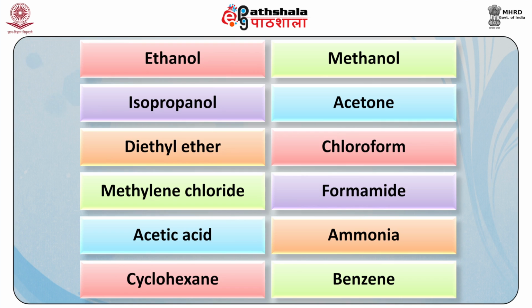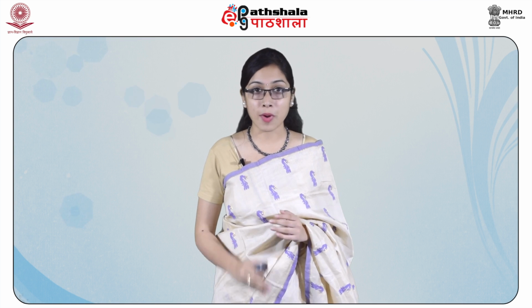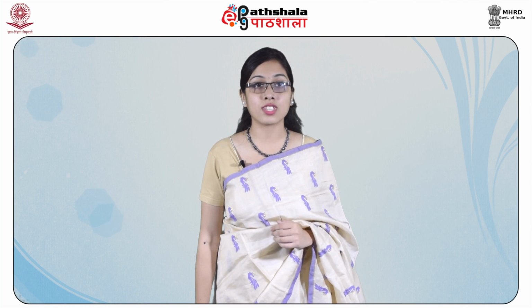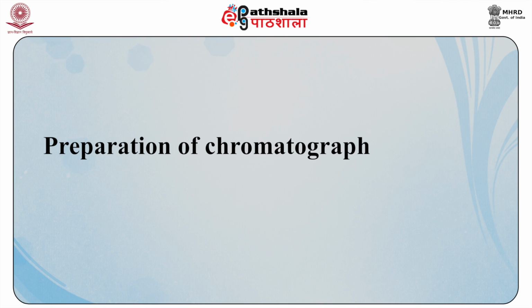Usually solvents such as ethanol, methanol, isopropanol, acetone, diethyl ether, chloroform, methylene chloride, formamide, acetic acid, ammonia, cyclohexane, benzene can be used alone or as a mixture as a mobile phase. The general procedure that is followed in case of paper chromatography follows sequential steps, wherein the first step is preparation of chromatographic chamber.